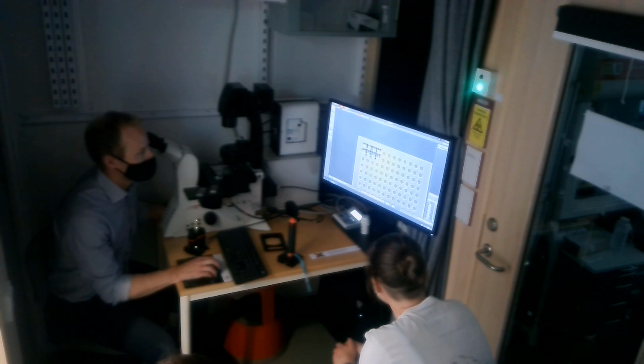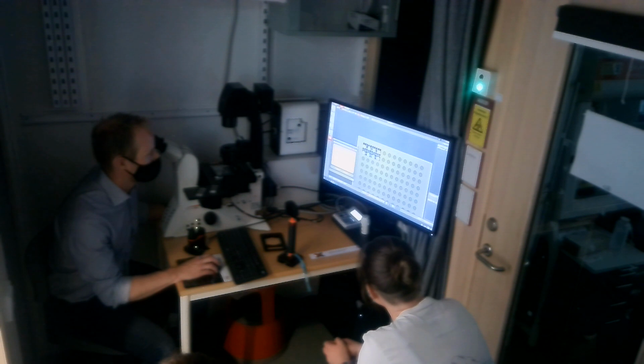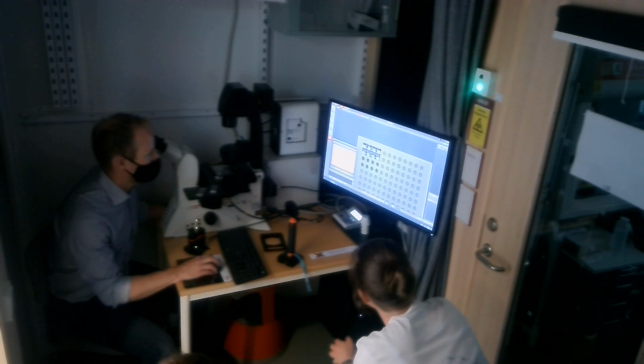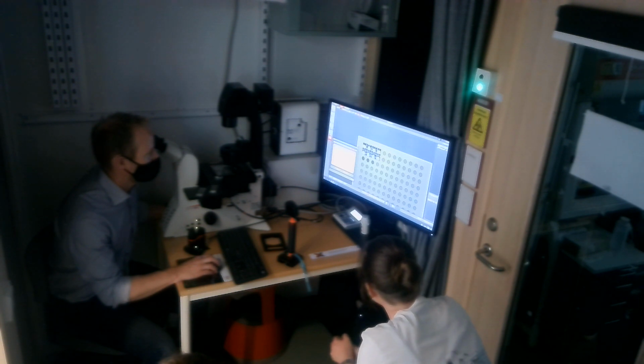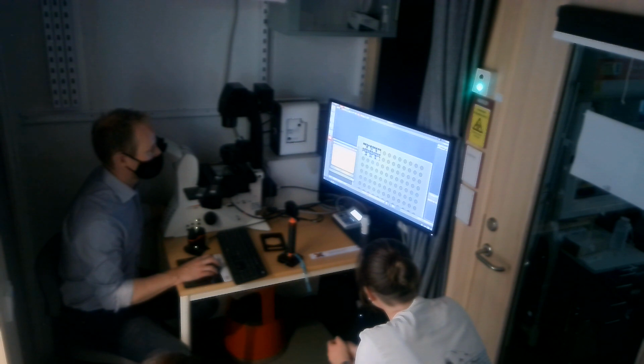So now I duplicated to all chambers. Of course, that was way too many. Let me redo that instead. Yes, I will do this. I will use this faulty one. It was these ones, right? Yeah. Not the 4, only 1, 2, 3. Okay. So let me actually save some time, and we do these 3 in the top there. And I will do a few different regions.